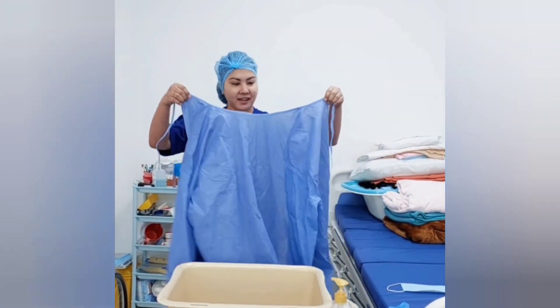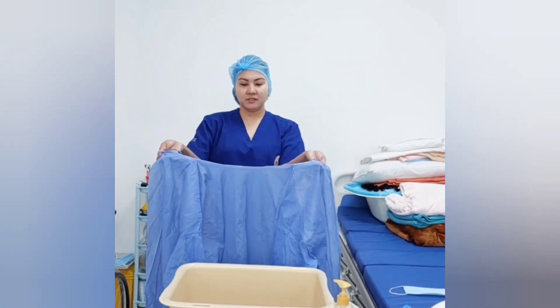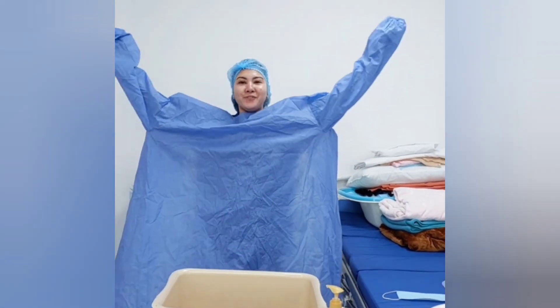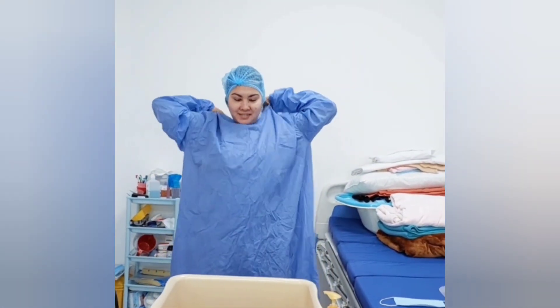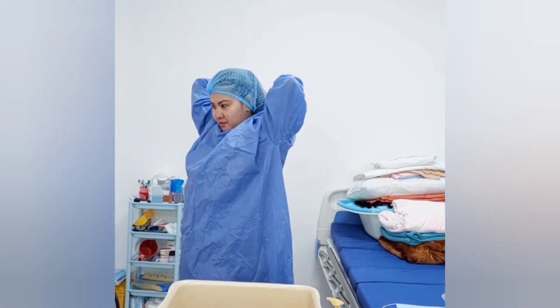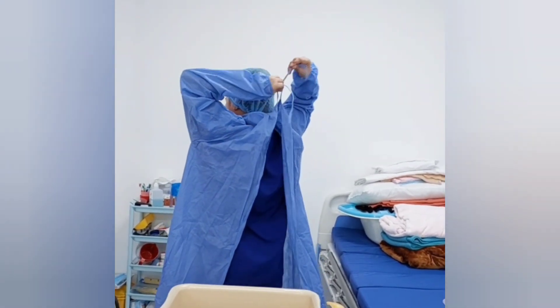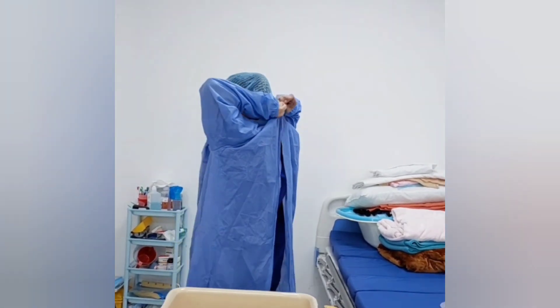Next, I have my PPE gown, so I will don this PPE. Fully cover the torso from neck to knees, wrap around the back, and tie it up. Make sure to put a ribbon so it's easy to remove later.